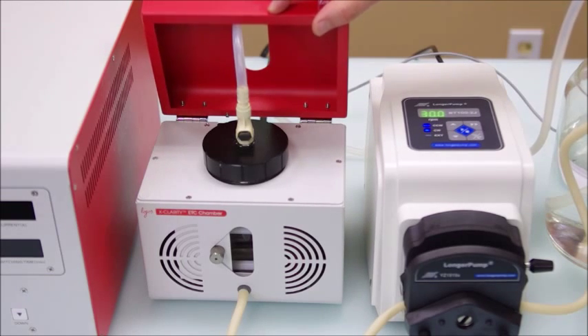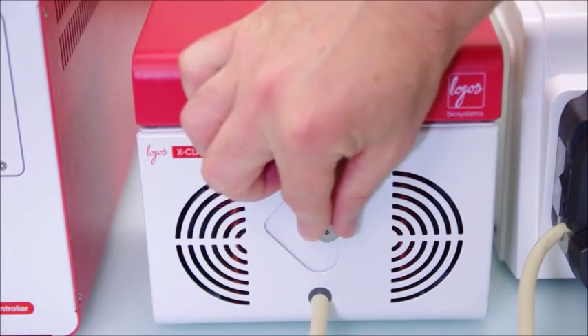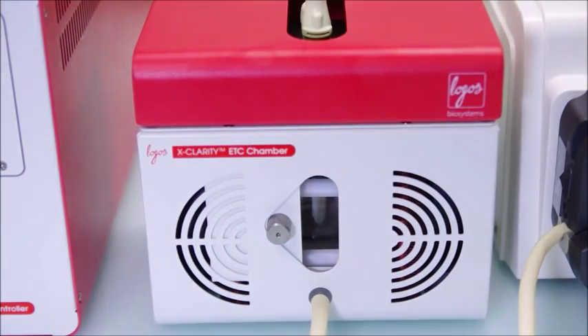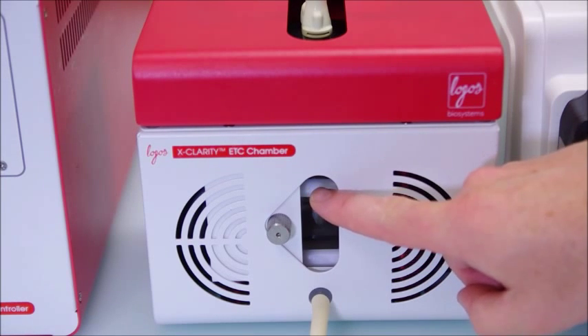Now on to filling and draining. Prior to placing a sample in the chamber, you will want to fill the chamber to about three quarters full with the clearing buffer. The chamber has a view port that may be opened and allows you to monitor the buffer level. A good rule of thumb is that you want to fill the chamber to the lower part of the upper plastic support beam that you see running across the chamber.